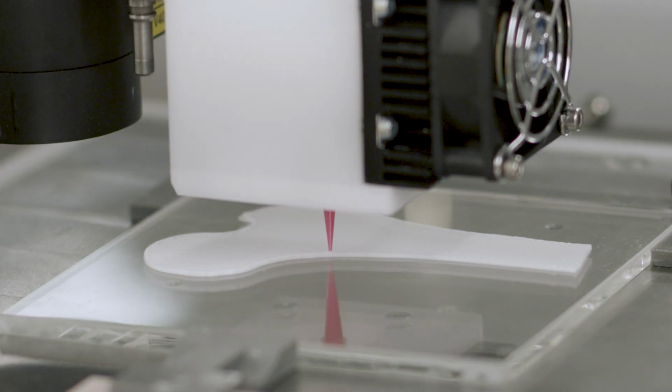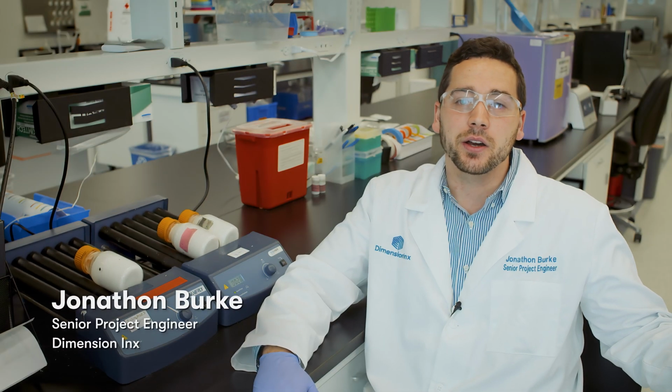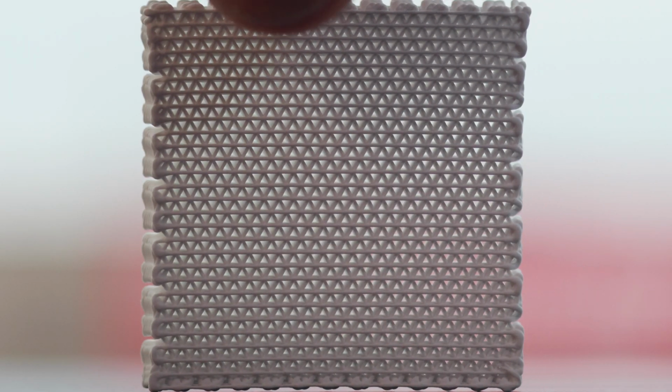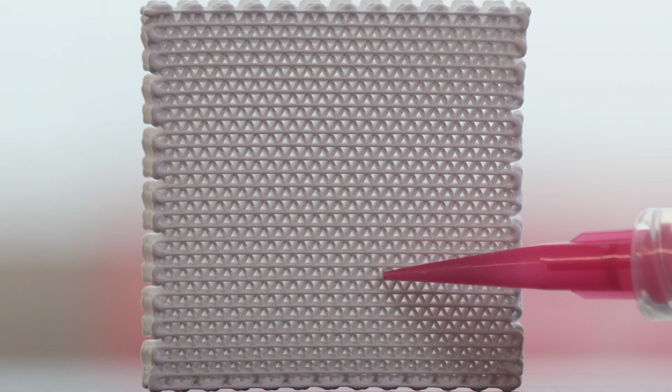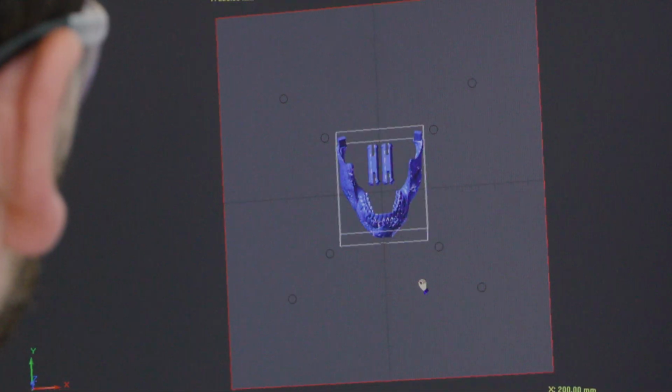The bioplotter is more advanced than our current ink formulation right now. It can go all the way down to like 50 micron, 100 micron size tips, and we can go towards very intricate shapes that would go into a certain maxillofacial defect. One of the great things about the 3D Bioplotter is how intuitive the software system is. It's so easy to use and really allows us to be able to do what we need to do.